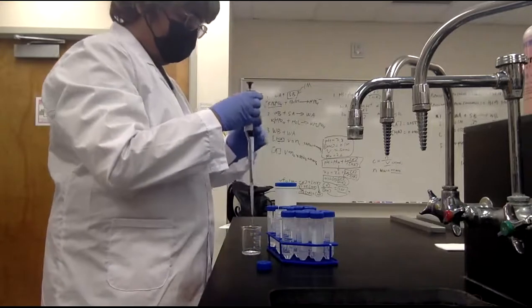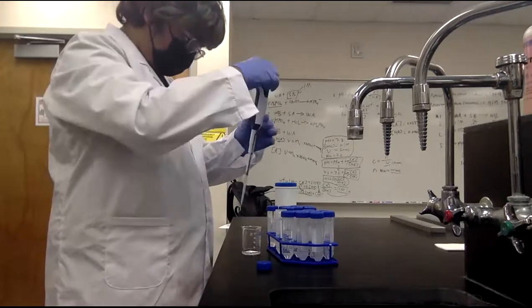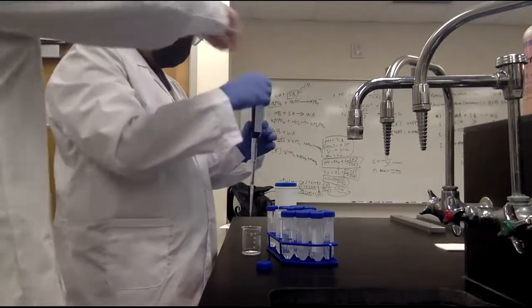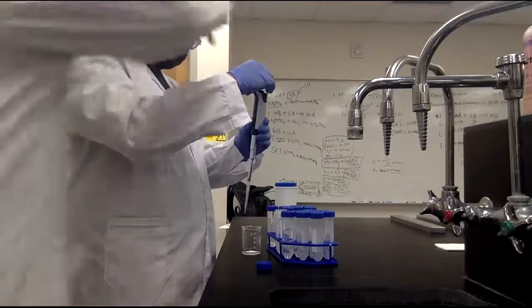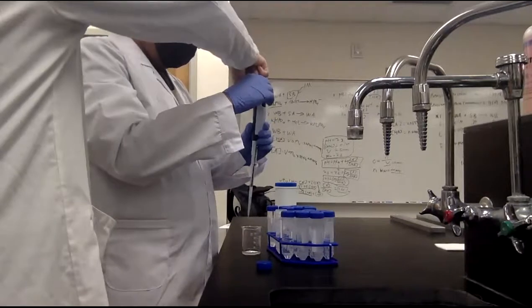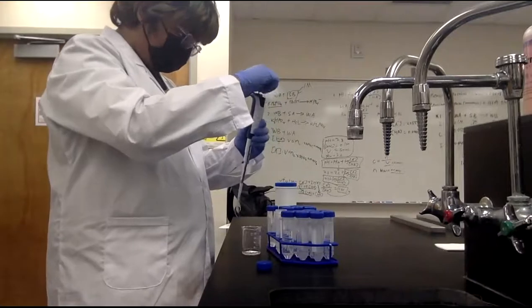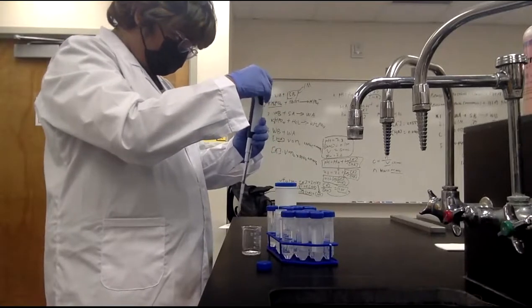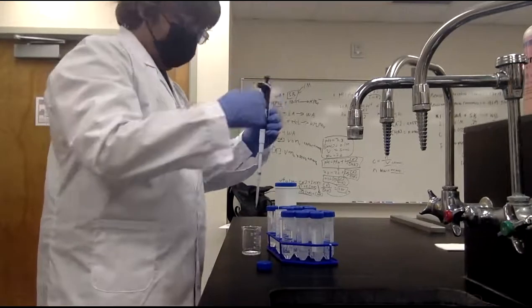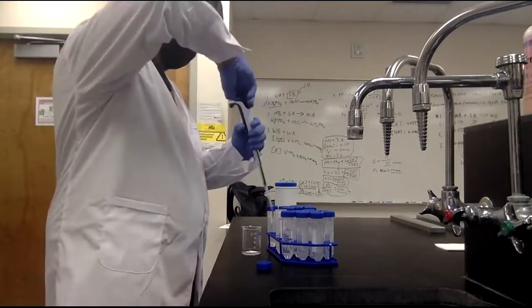Because now we need to make it 800 or so, how much did you say? 800. How do we change this thing? You just scroll it counterclockwise. So now do you see here? You unlock the knob, right? You push this one from here to here. Oh, I see. Yes, now it's 800. I guess we lock it again. Yes. Like, it doesn't change.